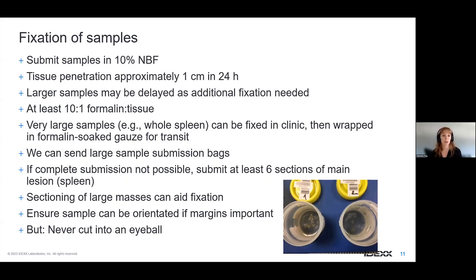Another thing you can do, for example for the spleen or legs or whole, large samples, is fix them in formalin and then wrap them in formalin-soaked gauze and put them in transit like that. And we can support you with large submission bags as well.